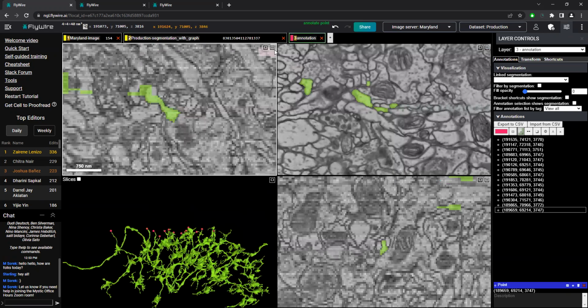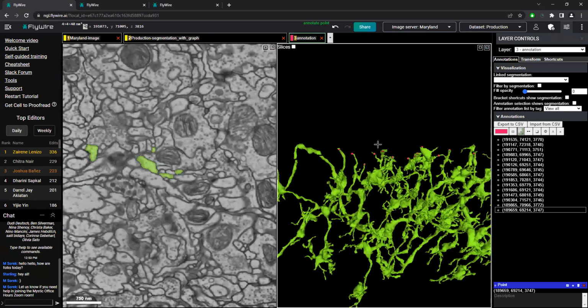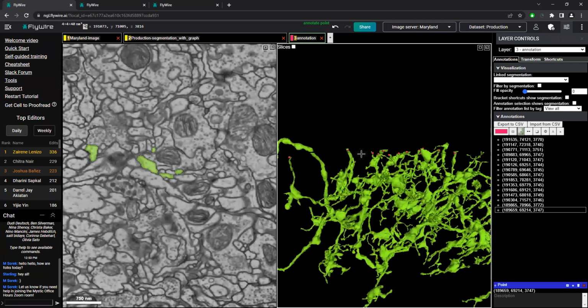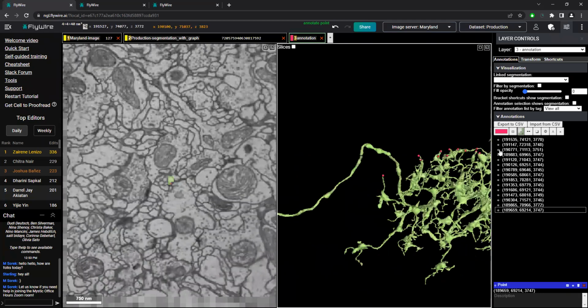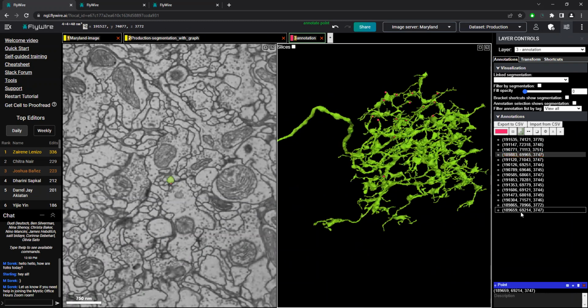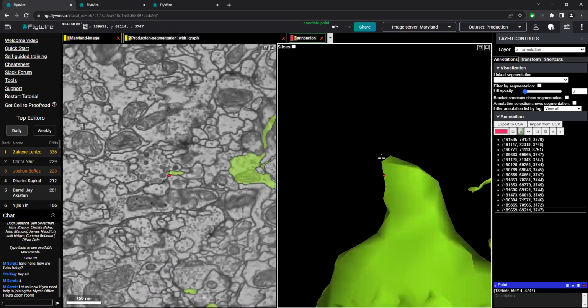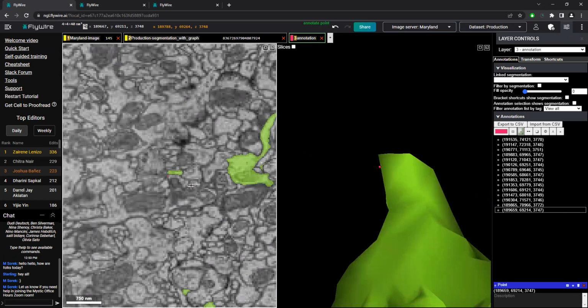I'm just going to go back to my 2D view real quick. I want my clear one. Thank you. And we'll go through and check each of these points. It's nice because if you drop these points, you don't have to precisely click. You can just jump to the area where one is, and then we can remove the annotation points so we know we've checked that already.